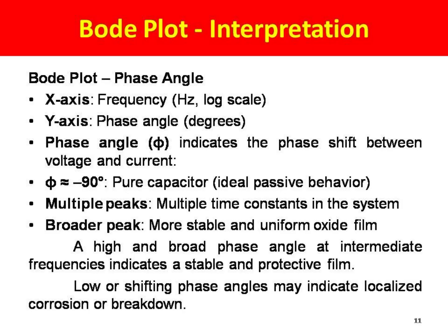If you get multiple peaks, then there are multiple time constants in the given system. If it is a broader peak, a more stable and uniform oxide film is formed. A high and broad phase angle at intermediate frequencies indicates a stable and protective film. Low or shifting phase angles may indicate localized corrosion behavior or corrosion breakdown.